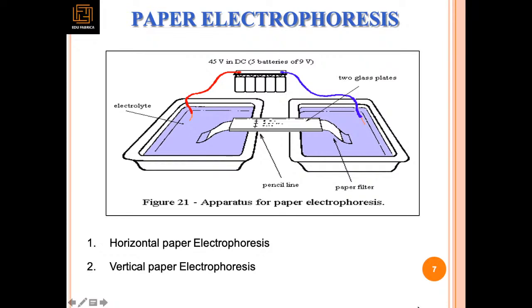Sometimes capillary electrophoresis and isotachophoresis are also used, but usually they are not highly demanded in molecular biology or analytical techniques in biotechnology. Still, they are quite important from your examination point of view, because many questions are asked from this perspective also.